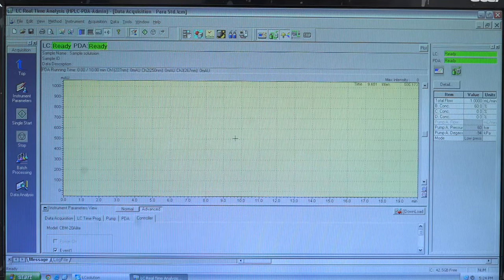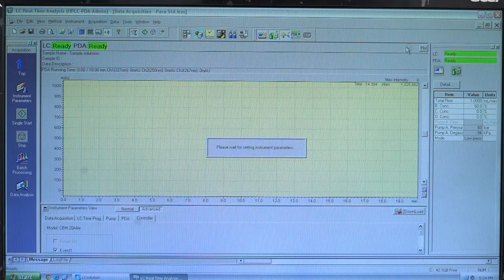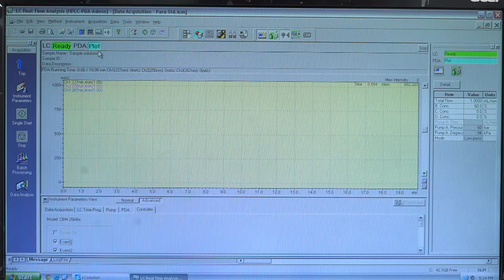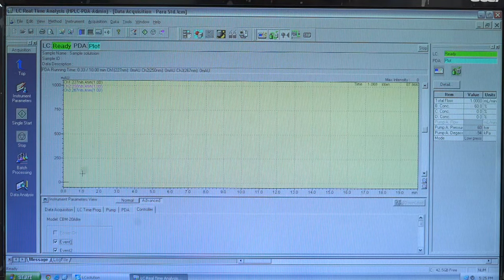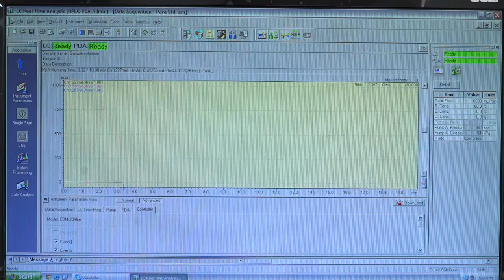With these settings saved, we will now start with baseline correction or column equilibration. We have already put our mobile phase and will click on Plot. Here we can see the baseline plotting has started. A straight line indicates the column equilibration, and the system is now ready for standard and sample injection.